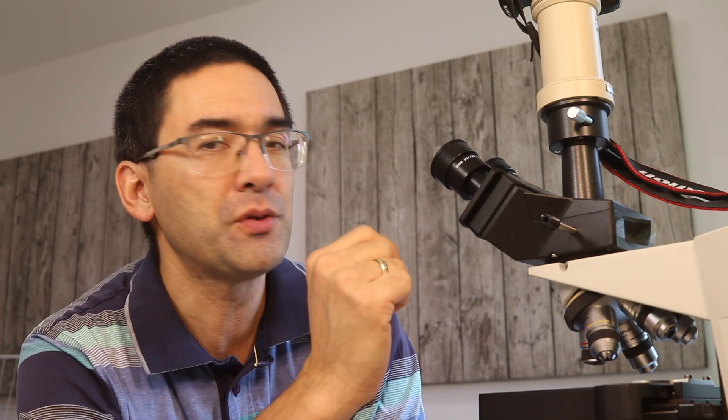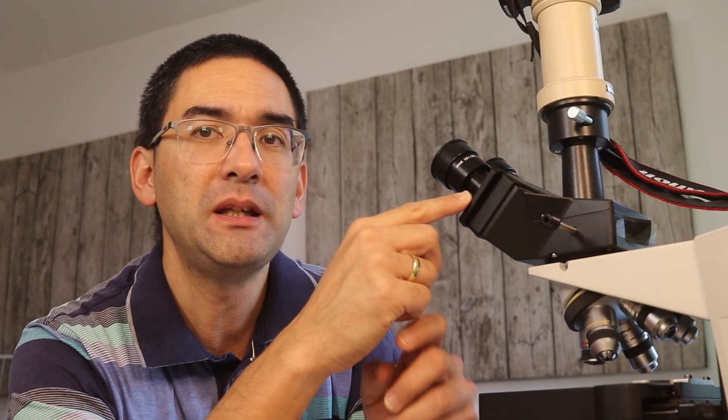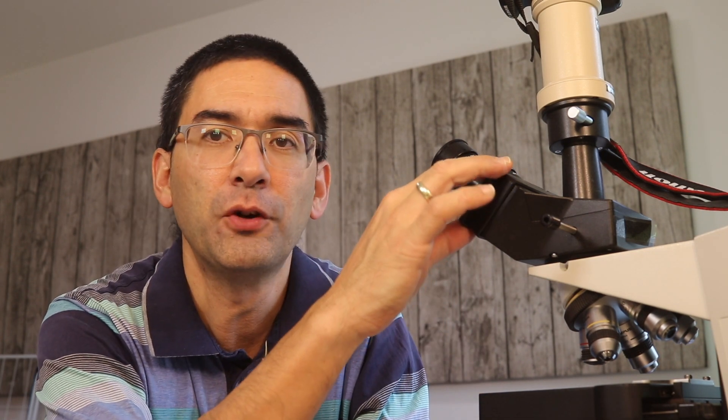These compound microscopes, they have an inverted image. And even though there are prisms also in here, these prisms do not flip the image around, but rather they are there to simply divide the light beam for two eyepieces. So the function is a little bit different.